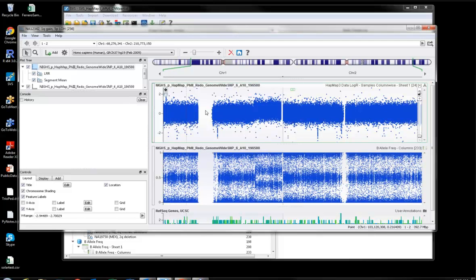As you go down the length of the genome, and this is still drawing in the segment line, you have a lot of noise around this baseline around 0. Depending on the platform you're working with, if you have data coming from a CGH platform or a SNP platform, and how much redundancy there is in terms of the number of probes per marker, you may have more or less of this noise. But what we're looking for is some kind of consistent decrease or increase.